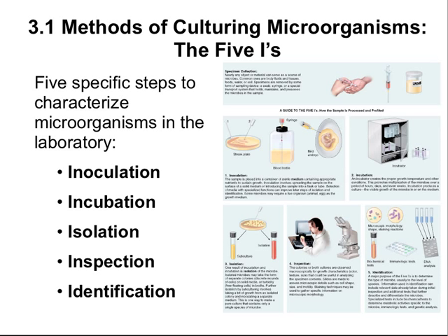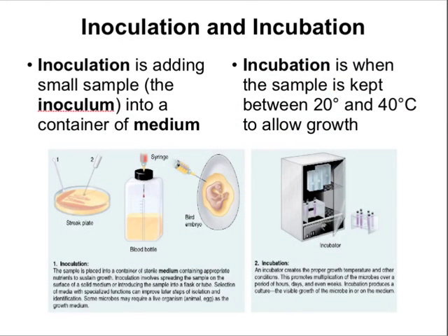These techniques are used by anyone studying microorganisms. We call those people microbiologists. This includes students in the lab, as well as researchers that are isolating drug-producing bacteria, for example, from soil, or clinical microbiologists that are determining the source of a particular infection by analyzing fecal samples. By taking a closer look at inoculation and incubation, inoculation is the procedure that we use to produce a culture.